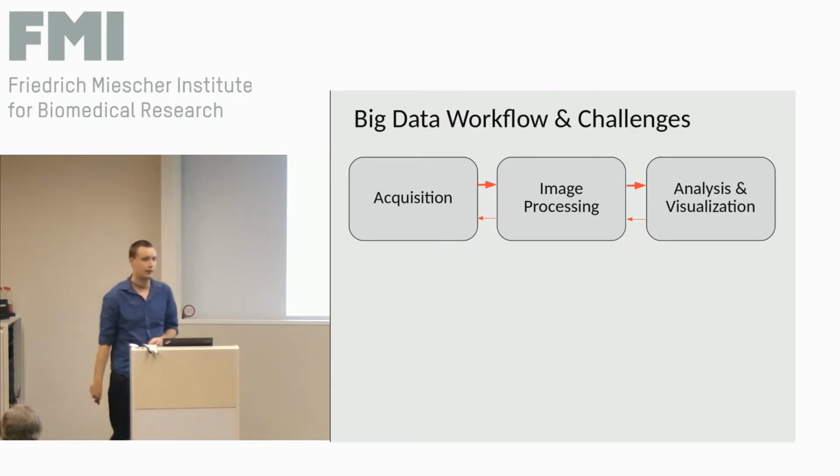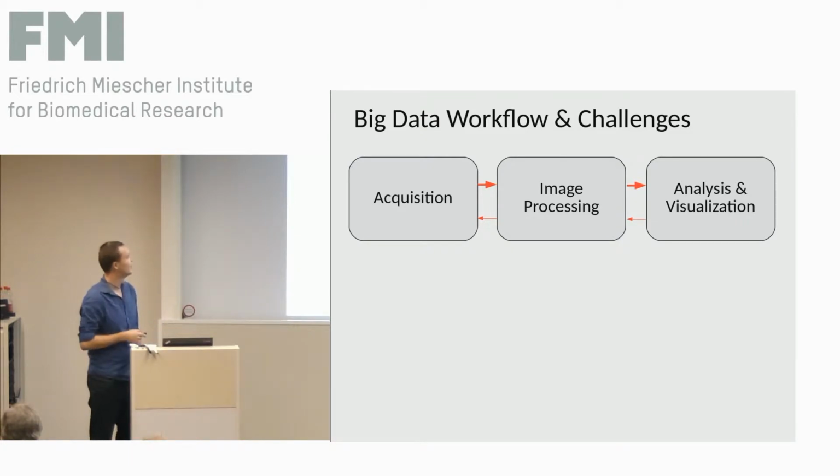And they're important, from experience, that when you do image processing, you might also want to inform the acquisition process that maybe something is going wrong, and you should modify parameters or stop it. And also when a biologist analyzes the data, there should be some way to reprocess just these parts to improve on the results. So there's also a flow going back.